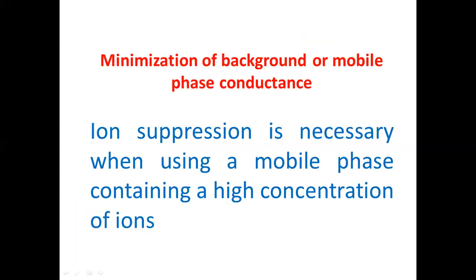So how to minimize this background electrical conductivity or the conductance of mobile phase? It is very simple. We have to suppress the property of the ions of the mobile phase.